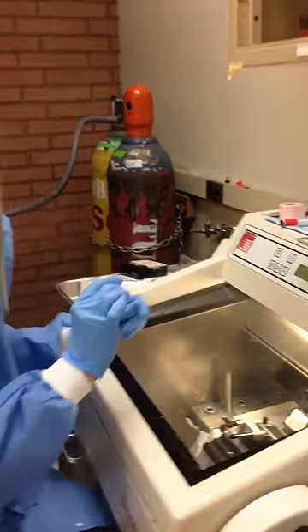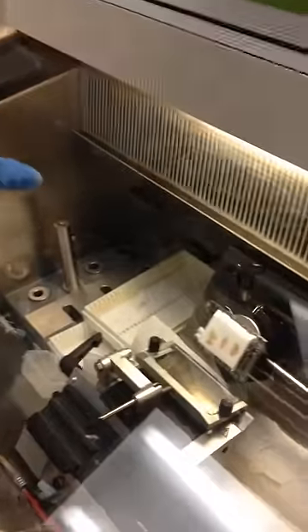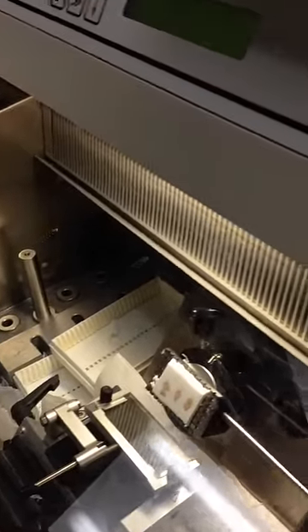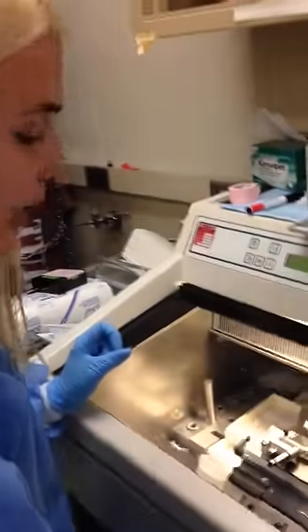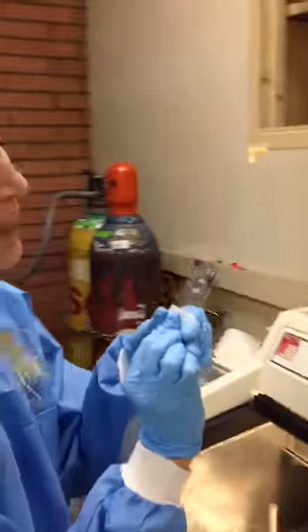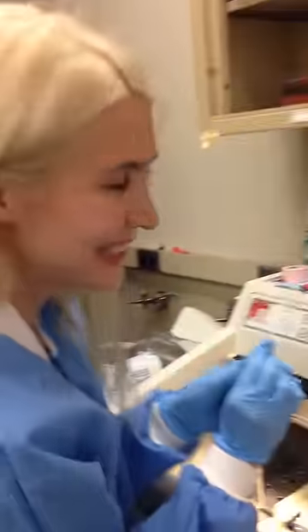We've cryopreserved the brains and you can see the sample right here. It's in the cryostat so it's really cold inside, and the machine cuts the sample into thin slices which I'm then collecting on the sample glasses. And this is how we do it.